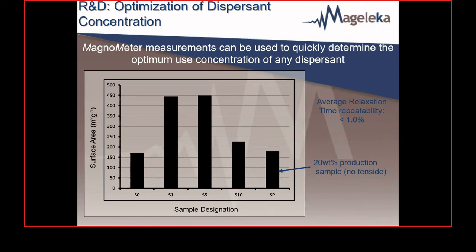Here, what we're taking is some dispersions of a nanographite. These are suspensions of the dry powder prepared by small bench scale milling, at a constant mechanical energy in the laboratory, with increasing addition of a polymeric surfactant dispersant. It was actually a naphthalene polycondensate, for anyone that's interested. I use nanocarbon because everyone talks about it.